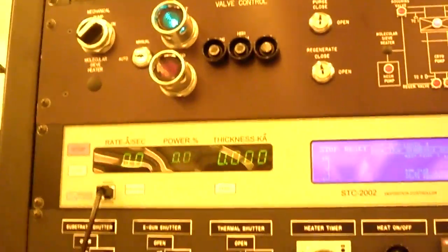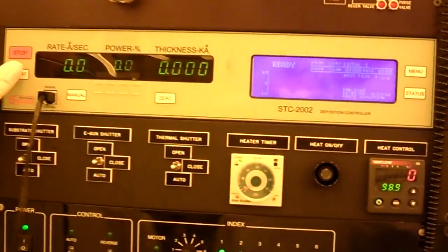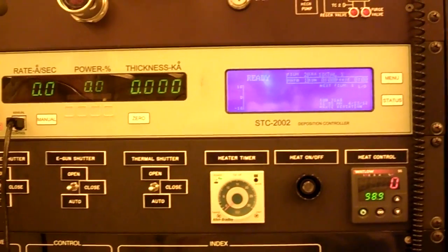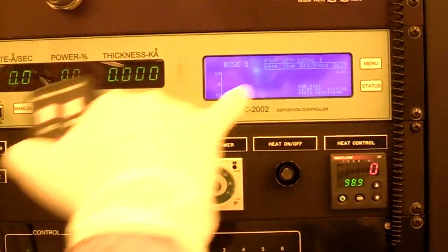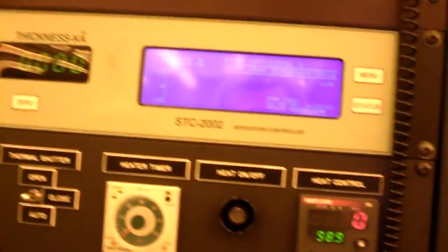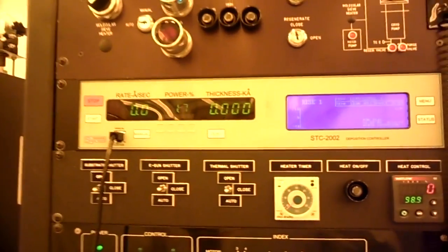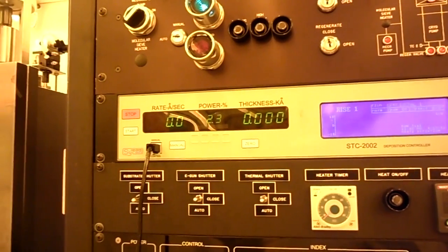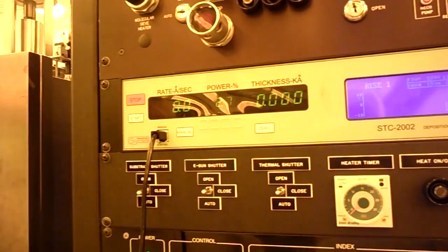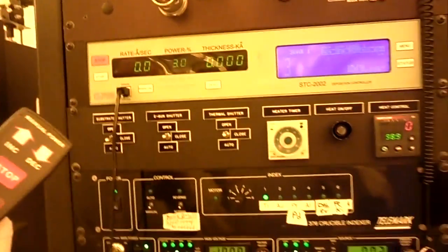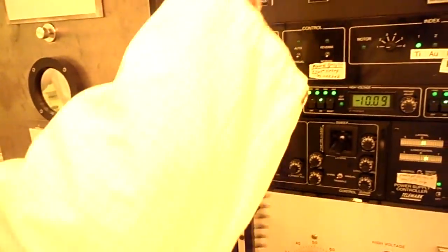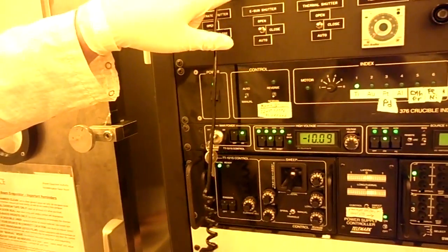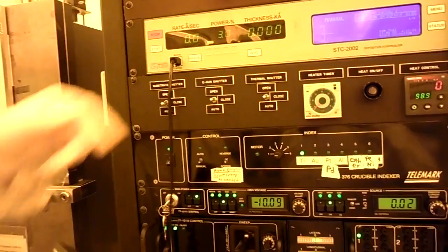So now we're ready to actually start from here. We're going to run it manually, but the default mode for the pre-programmed films is automatic. So when I press start the first time, it's going to say ready. It still hasn't switched films or anything. I press start again, it'll switch to film one. It checks the crystal, and then it goes to a pre-programmed rise point and the power. It's going to go all the way up to 3%. I let it go ahead and rise manually because otherwise it can only go up by a tenth of a percent. So I let it rise automatically. Then I'm going to press stop because that will turn it off. I'm going to press manually. You'll see this light comes on. That means I can control it here.